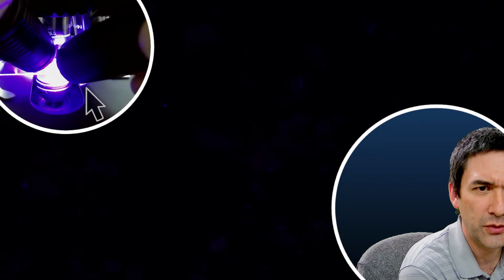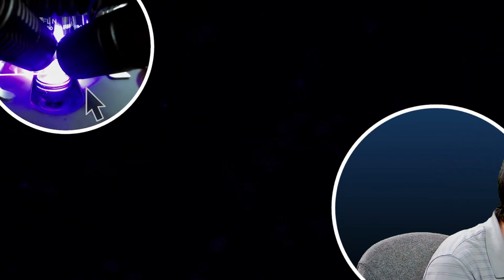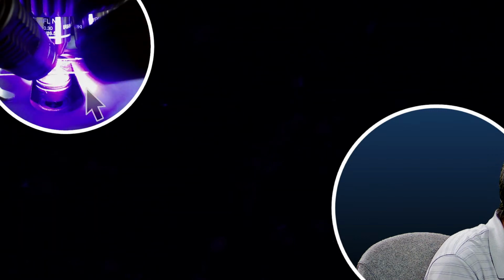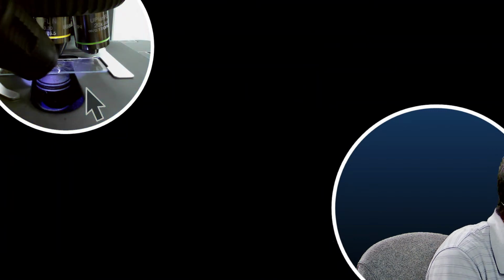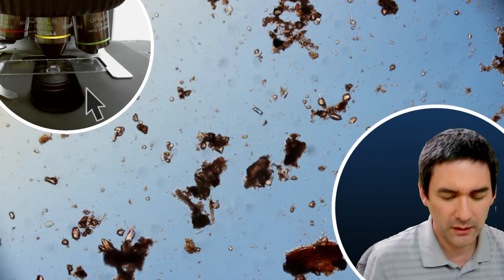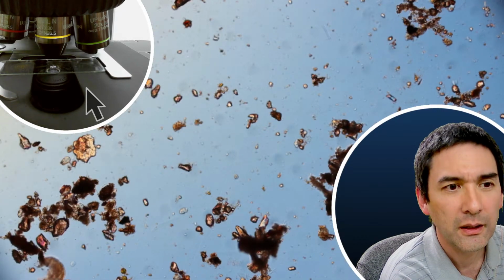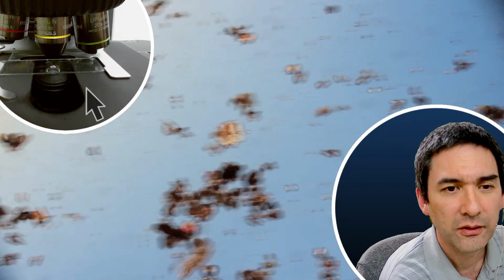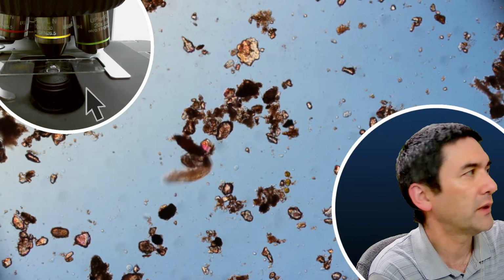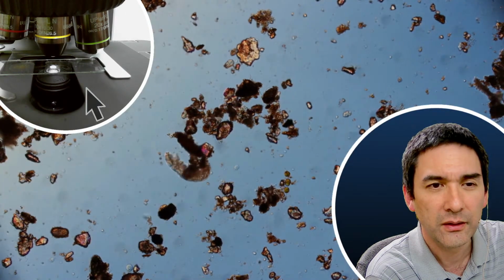Now even here, the camera is not able to detect anything, which is kind of surprising. Normally what you would expect is some sand or some material. Okay, now I accidentally bumped the... Here it is again. Now I have to go down again with the exposure time and up with the light so that the frame rate is right again.